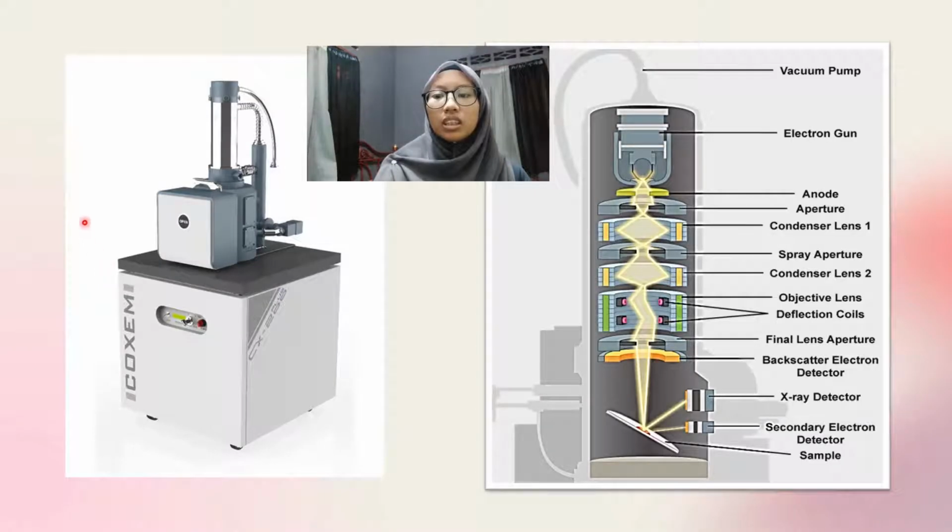This is the full size SEM. We can see it's very large, and these are the components.